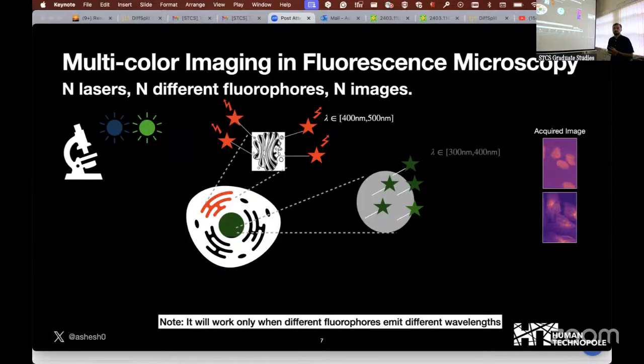If you don't have them, you won't be able to see the object with fluorescence microscopy. You need them because you need the light coming from the specific structure that you want to image. But if you just have a standard light, say a tube light, would you see everything? Yes, that is transmitted light microscopy, for which you do not need this, but then it loses the specificity. You get everything that is present in the cell. Sometimes you just want to track some specific suborganelle, and for that, this is used.